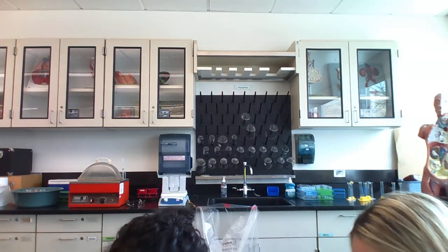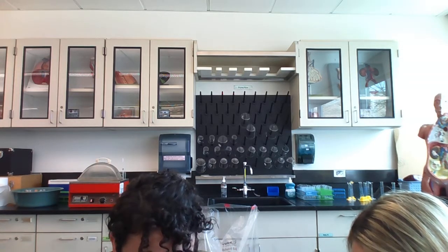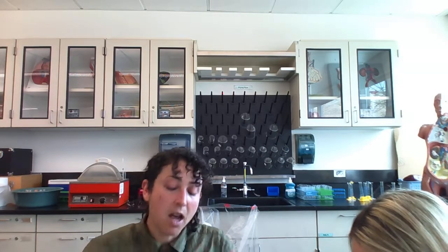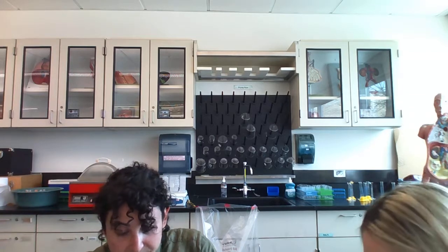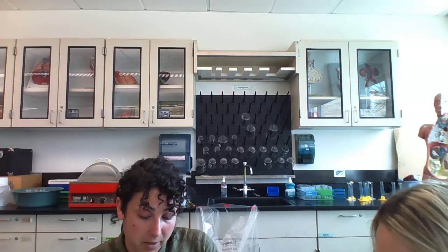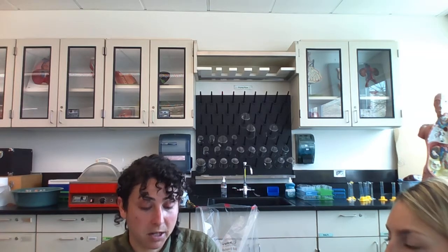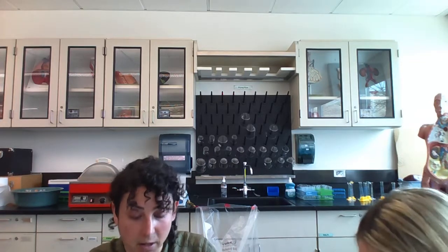Okay, I thought I got it. So this should make sense because this is fat and lipase mixing. So there should be an observable reaction here. But you're also heating the lipase, so if the enzymes are denaturing, it may not do its job. Here, this should be the best example of what happens in your body: the litmus cream with the lipase. And I think the reason we're mixing it with the litmus cream is so we can also see the pH change as the lipase does its job breaking down the fats in the cream.